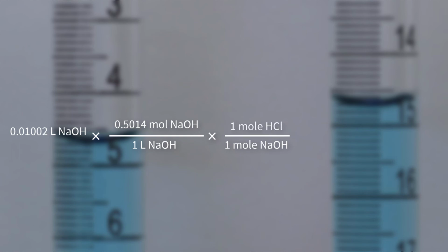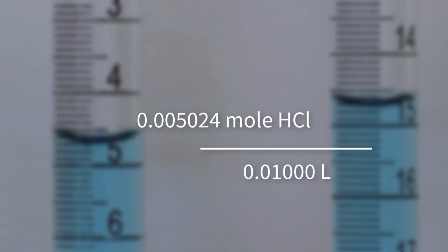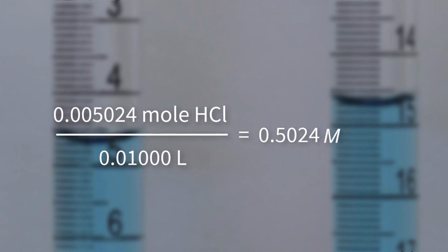Now we're ready for the mole-to-mole ratio. This can be found in the balanced chemical equation and allows us to determine how many moles of acid were neutralized by the sodium hydroxide. Remember, the indicator solution showed us when to stop. It changed color when all of the acid was reacted. Now we have the missing piece of our puzzle, the number of moles of acid in the flask. Dividing the number of moles of acid by the volume of the solution yields the molarity of the solution with units of moles per liter.